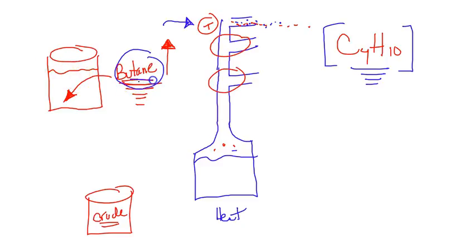If it was pure butane, okay, we would get a molecular mass that would approximate the theoretical value. Now, of course, with a molecular mass, in this case, we have this molecule, and if we had a mole of this molecule, we'd have 4 moles of carbon. And each carbon has a mass of 12 grams per mole.